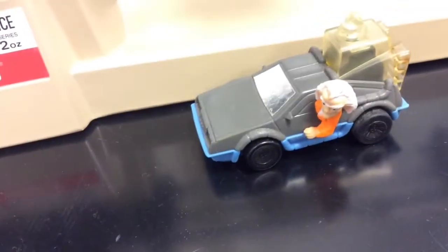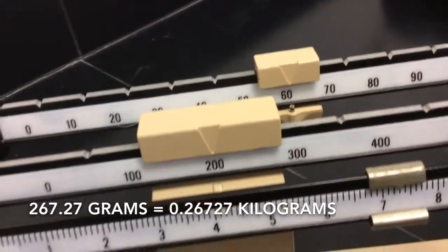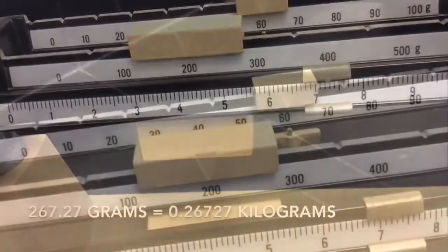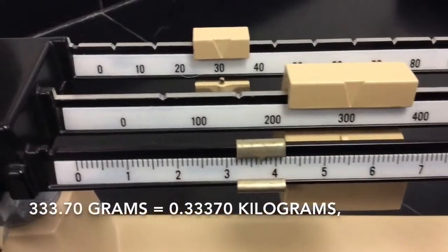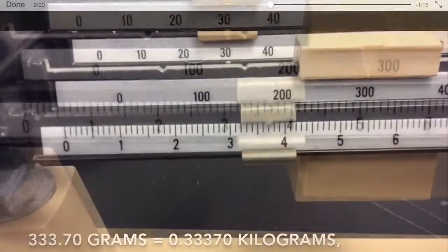This balance can and should be read to the hundredth of a gram. For example, 267.27 grams, or 333.70 — make sure you put that zero in there.